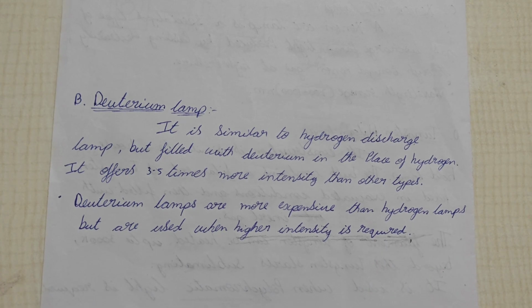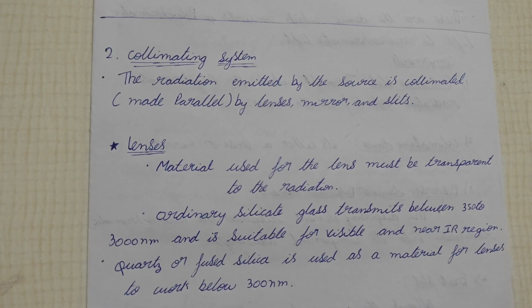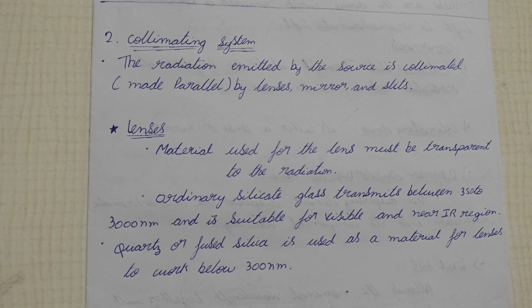Next, we are going through the monochromators and the filters. Guys, you may feel this video is lengthy. I'm explaining slowly because if you study this UV spectroscopy, you may cover almost every instrumentation, because the detectors, the monochromators, the lens, and the types of monochromator used are similar in other instrumentation.